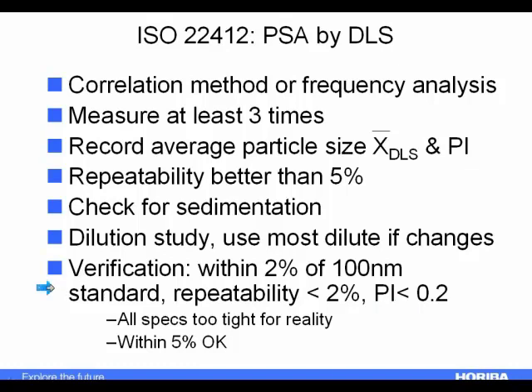Now, I sit on these committees, and I sometimes wonder, after these get out into the field and I start looking at the standard versus reality, and to be honest, compared to the real world, I think these specifications in the ISO standard are a bit tight. When you're in these committees, there's always pressure to drive people towards best practice, and there are always whatever other dynamics are going on in the room. So actually, I look at these specifications, and now we're in the world of my own humble opinion. I think these numbers are a little tight for reality.